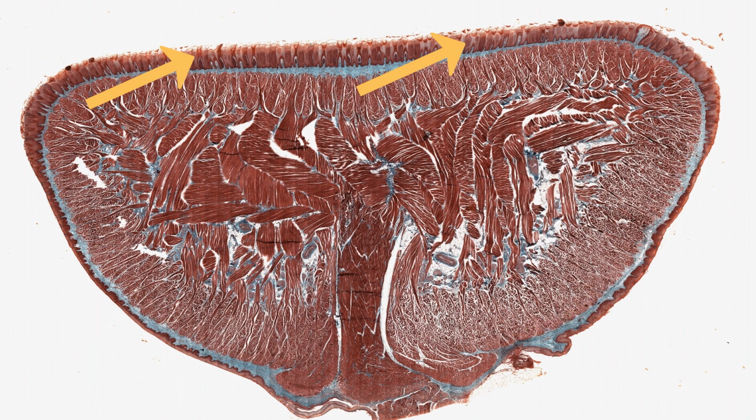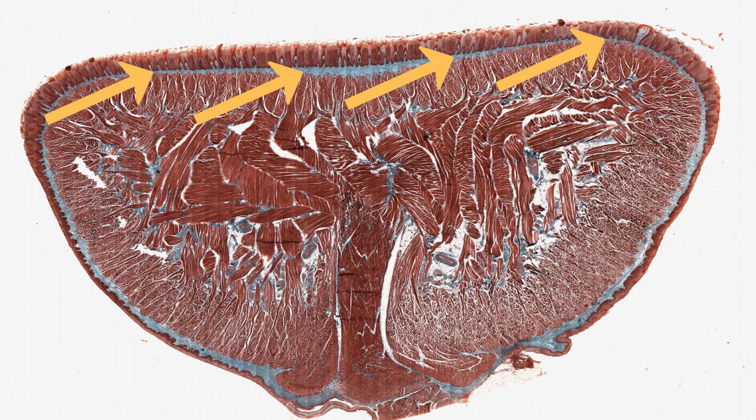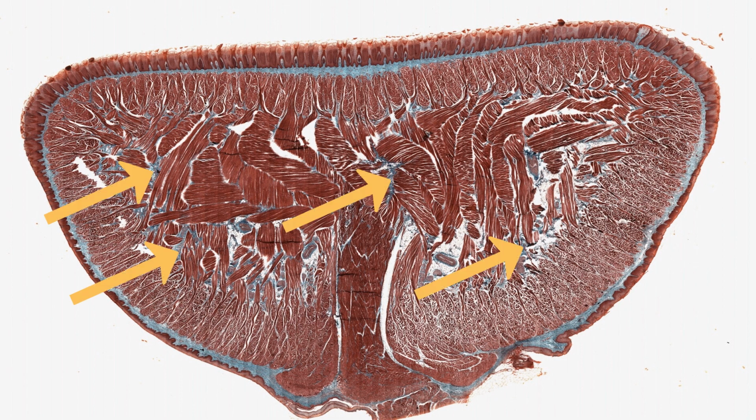The dorsal surface is modified with projections of papillae that I discuss in my lecture on the tongue. The green-blue ring under this epithelium is loose, irregular connective tissue, called the lamina propria. Loose connective tissue stained green also surrounds bundles of skeletal muscle fibres, which are stained red.